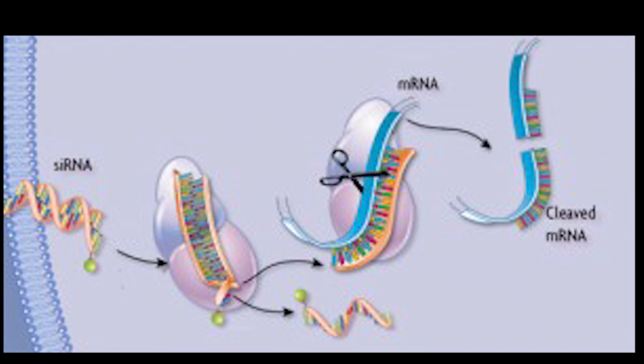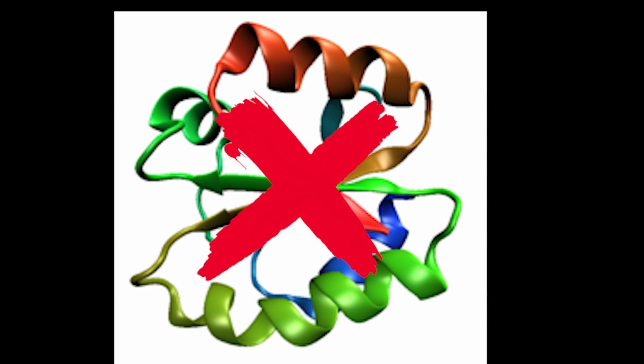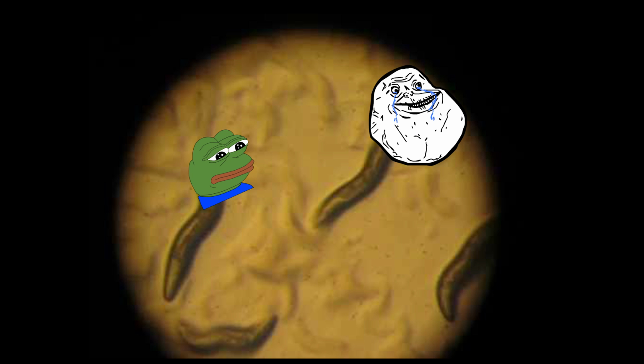The siRNA form a single strand and probe the cell for mRNA, which would be, in our case, both the natural C. elegans DPY11 and our fake dsRNA. The RNA-induced silencing complex would bind and cleave it, making it no longer usable. As a result, translation would never occur and the protein thioredoxin never formed. The protein for growth wouldn't be present and the C. elegans would never mature and stay as dumpies.